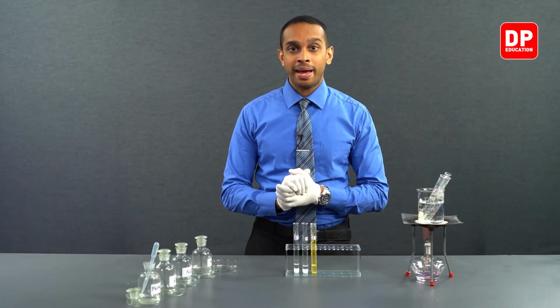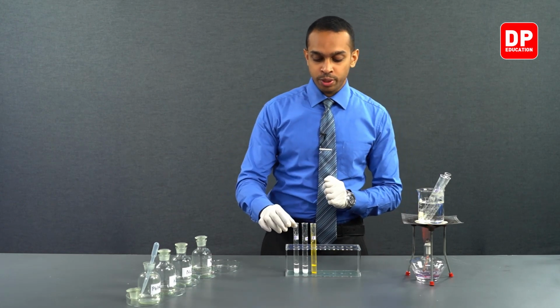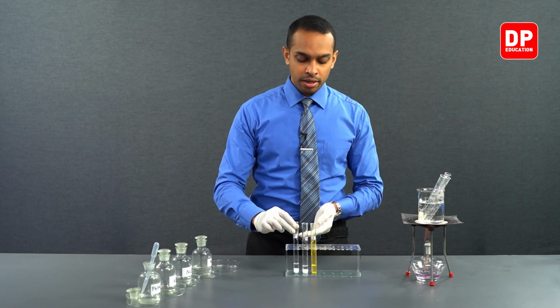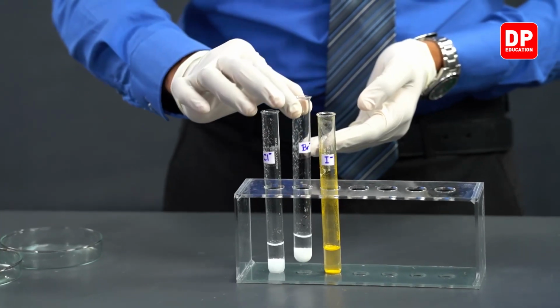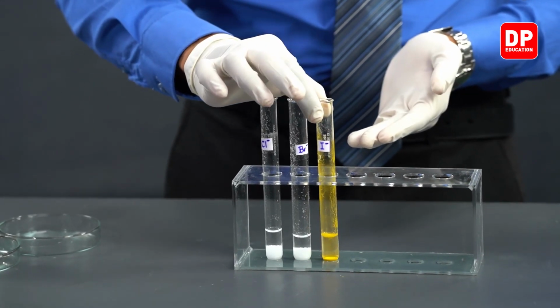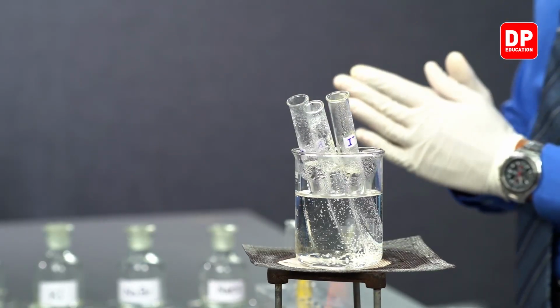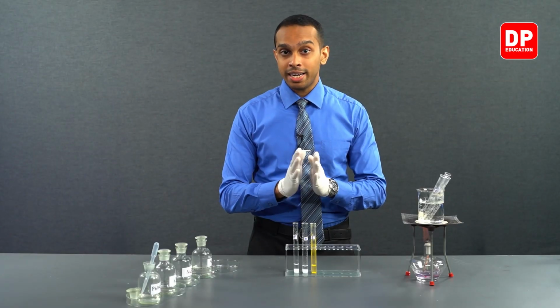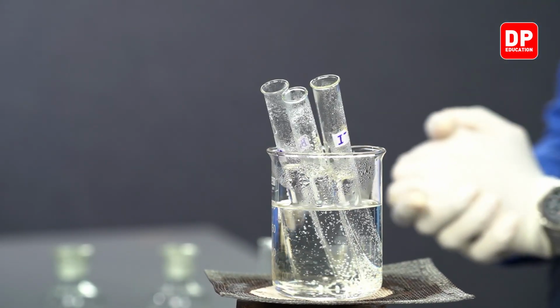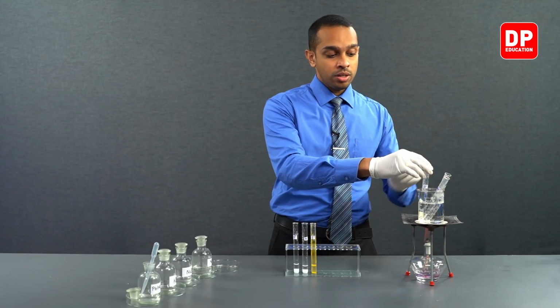Students, we are back after a while. Before we took a small break, we took a little bit of lead chloride, lead bromide, and lead iodide precipitates, transferred some of those precipitates into another set of test tubes, added water to those test tubes, and heated them for a while. Now we are going to be looking at the results.